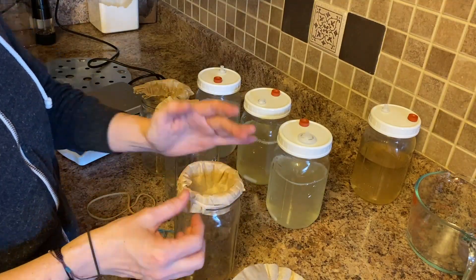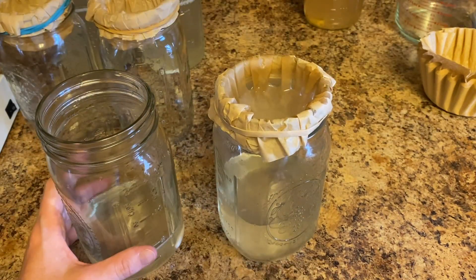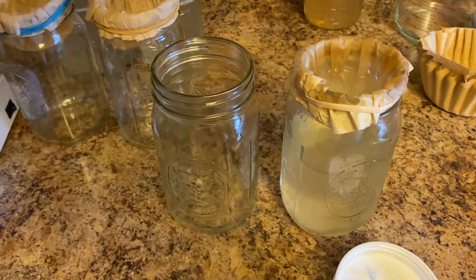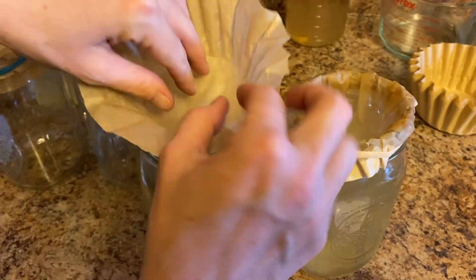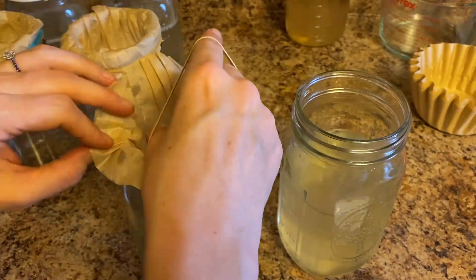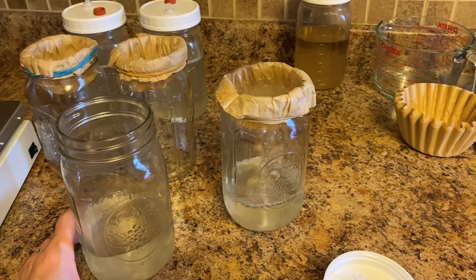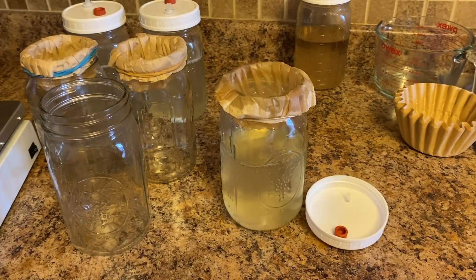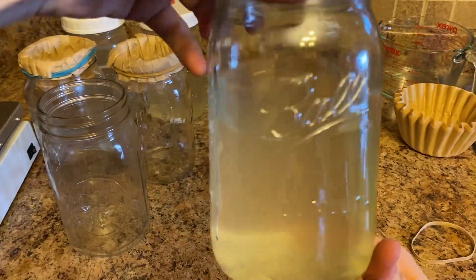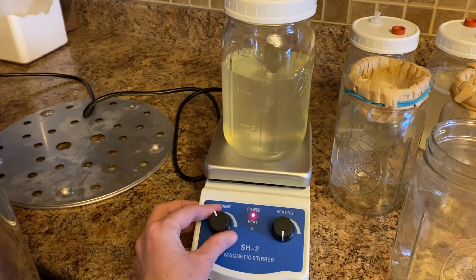Next, we need to strain the mix twice with a coffee filter. This helps remove a lot of the extra sediment sitting at the bottom. If you don't get all of the extra sediment, don't worry — the mycelium will eventually eat it. I like to filter the liquid culture twice because this gets about 80% of the sediment, and it comes out very clean and clear, which makes it a lot easier to see the mycelium growth. Then put the lid on and give it one last mix — now we're ready to sterilize it.